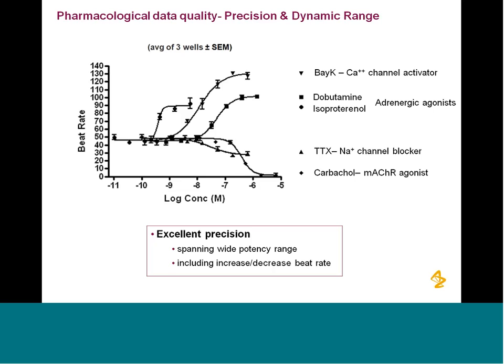And so part of the process will be, once the validation data is complete, we'll have to have discussions about how we're going to pair it. And then a good experiment leads to more questions than answers. So we'll have to figure out how we're going to supplement it with additional assays. What's going to be the trigger for this assay? What's going to be a positive or negative response in various things? What is it going to trigger as a follow-up assay? So we'll get there, but we're not there yet.